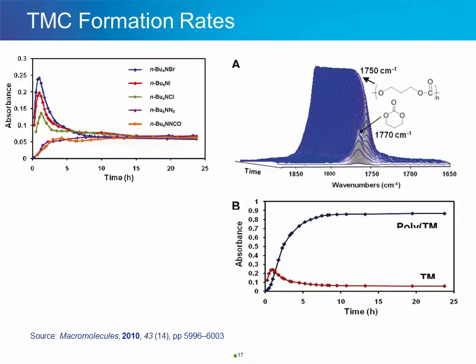I want to draw your attention to an important point here. The combination of in situ IR and NMR data together provided the critical information about this reaction, and rarely is one analytical technique alone sufficient to provide all the information required. The key is to have the appropriate tools in the lab that will provide a more complete set of information. And many times I have seen that it is the in situ infrared data that provides that extra insight which leads the researchers in the right direction.